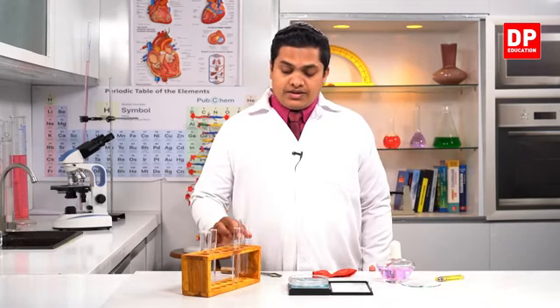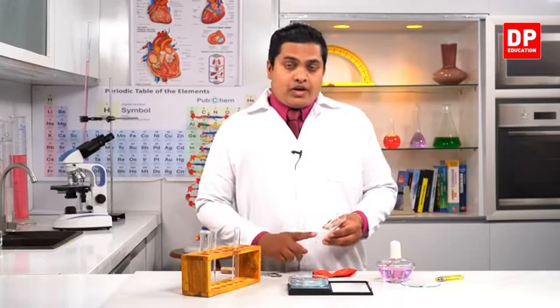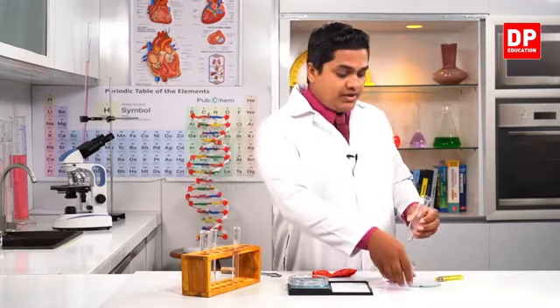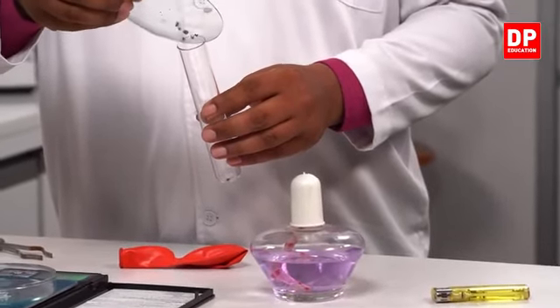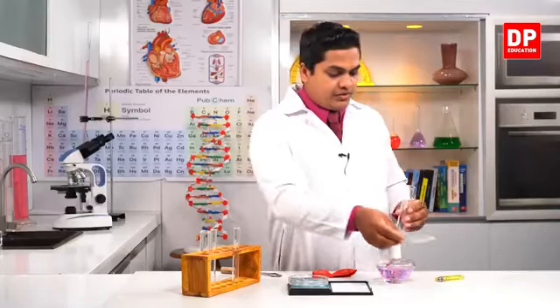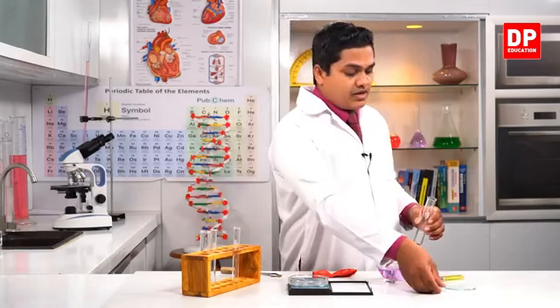So let's see. First, I'm going to take the boiling tube, and I'm going to insert these matchsticks into the boiling tube. In the next step, I'll remove these things.